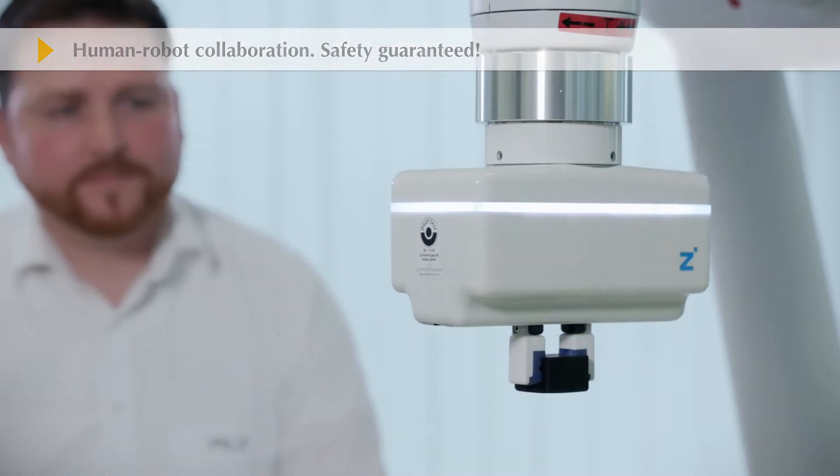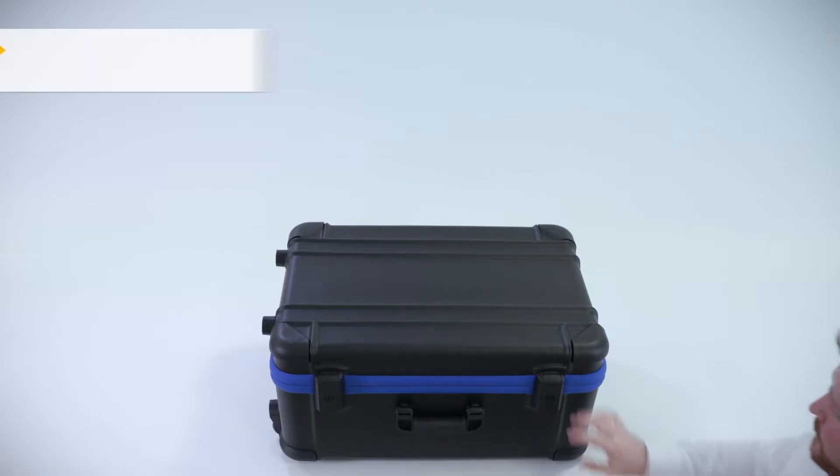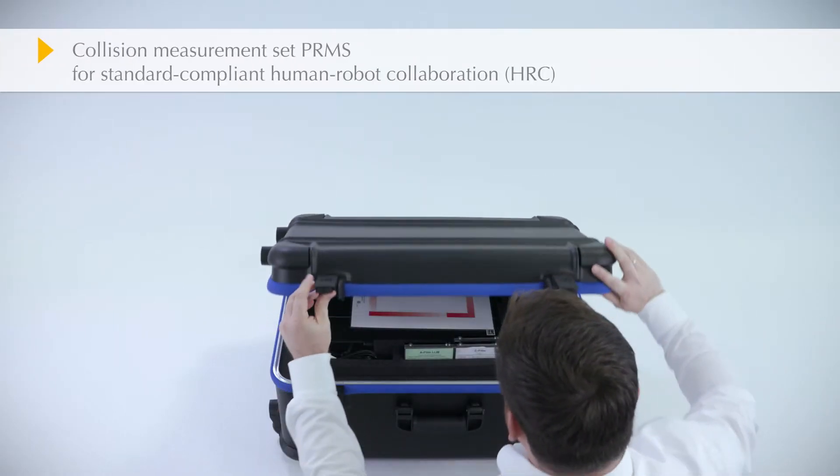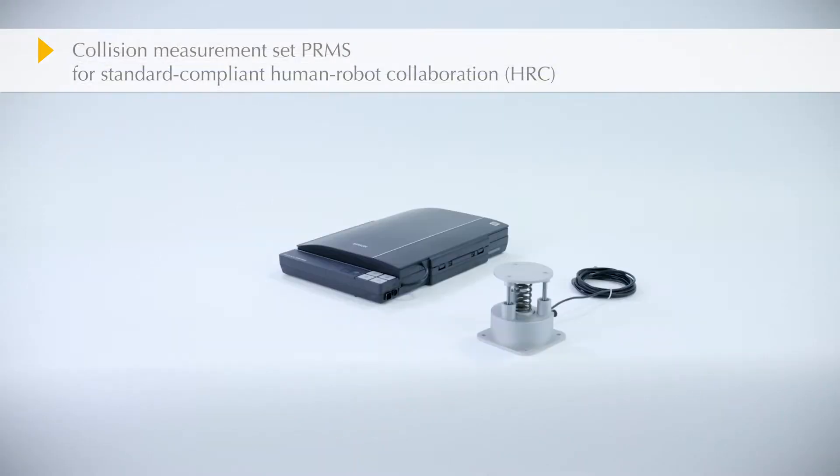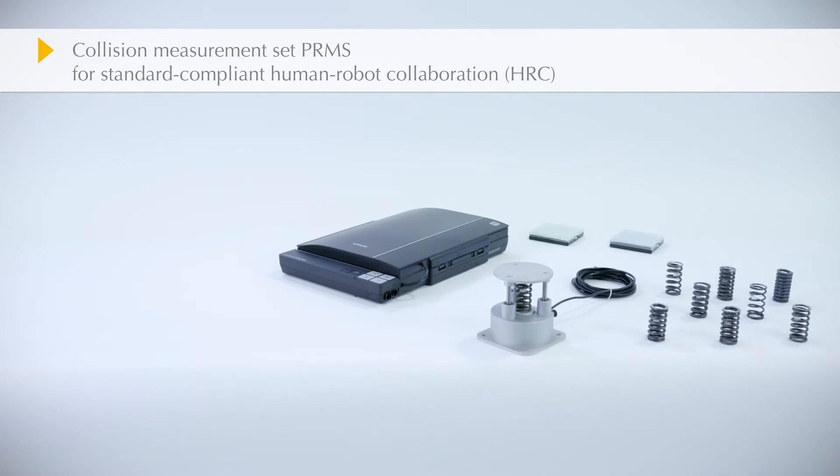Cooperation between human and robot presents particular challenges to safety and is regulated through technical specifications. The Collision Measurement Set examines human-robot collaborations, recording force and pressure.